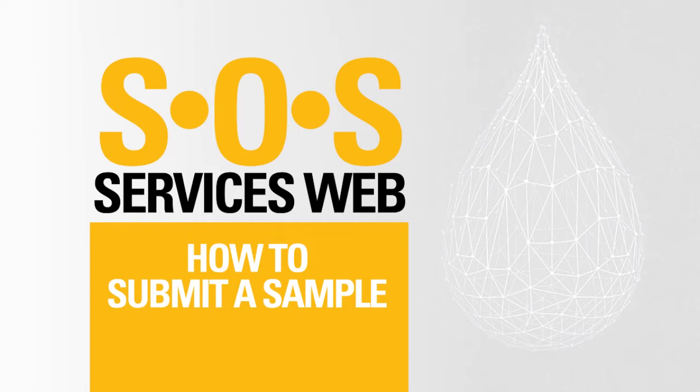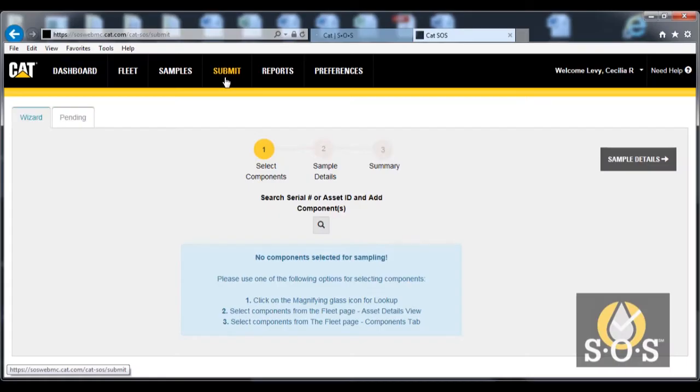In this module, we will provide an overview for how to register your fluid samples. To register a sample, go to the Submit page of the SOS Services web tool. There are 3 steps involved in registering a sample: selecting the components to be sampled, providing sample details, and then viewing and printing the sample summary. So let's submit a sample.